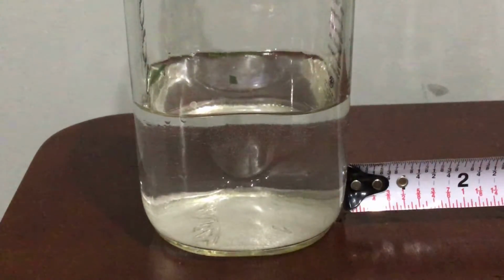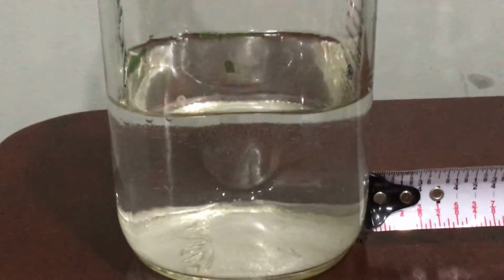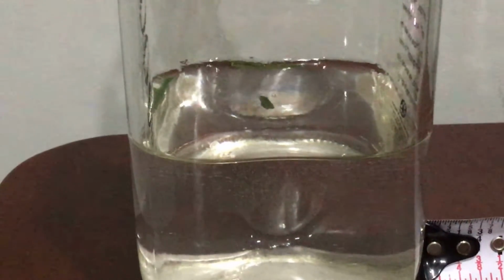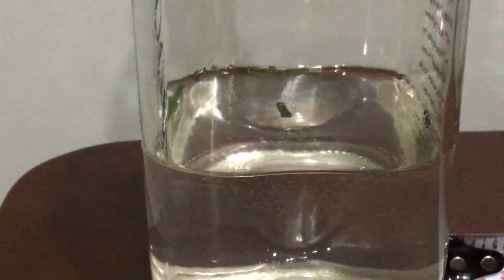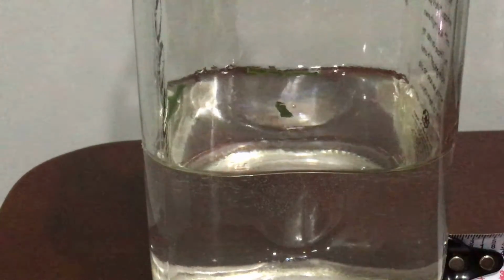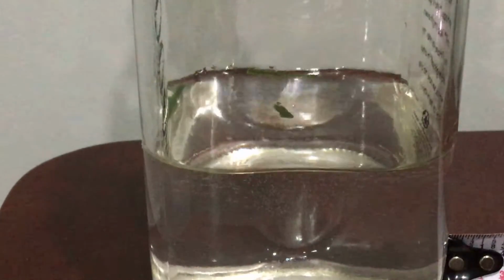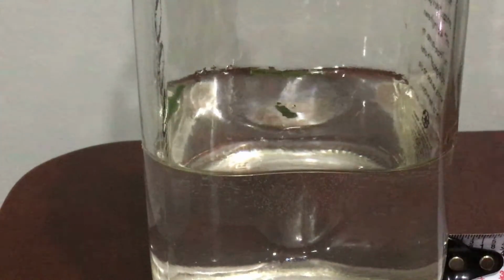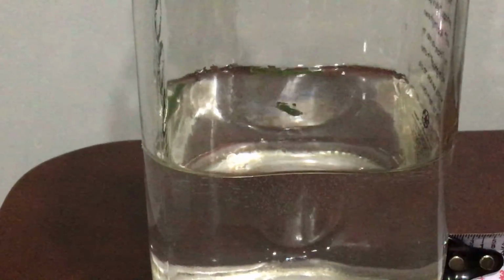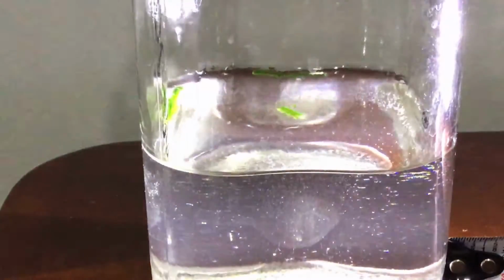So the first one, and I can zoom in, and I know it might get a little grainy here, but the first one that we're going to be doing is we are going to be looking at 6 inches of the lamp distance away. So I'm going to get my phone ready to go. Sorry guys, that's where my timer is going to be. I have it set for 3 minutes, and I'm going to turn the light on, and then you need to count the bubbles.